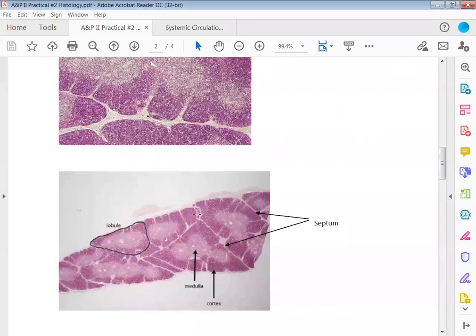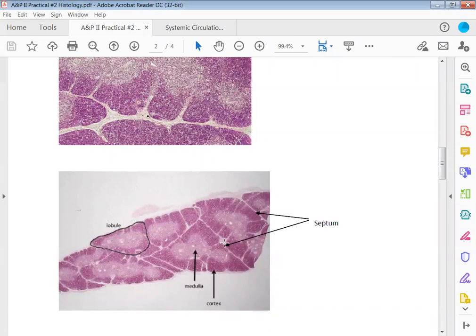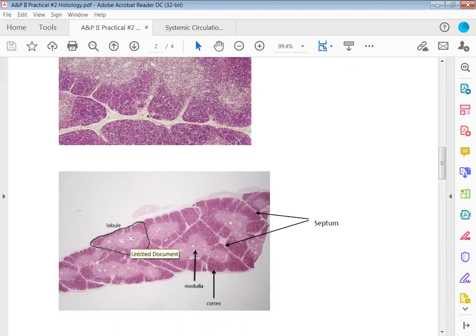Identify this organ or gland would be thymus. Identify this structure or area would be a lobule. Identify this structure here which is this white line would be a septum.